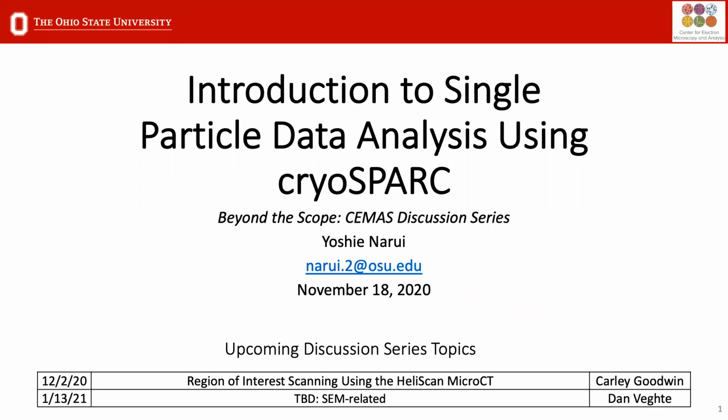Additionally, all those details that I had listed out on that slide, now is where it becomes important. I actually have to type in here the raw pixel size. I'm just going to do this real quick. And then the accelerating voltage, which is 300 kV. I have to provide the spherical aberration and the total dose. You can also provide negative stain data, but you'd have to select that here. And so I'm just going to go ahead and queue, which means I'm going to submit this job. I'm not going to go into explaining the lanes, but I'm just going to submit the job and let it run.